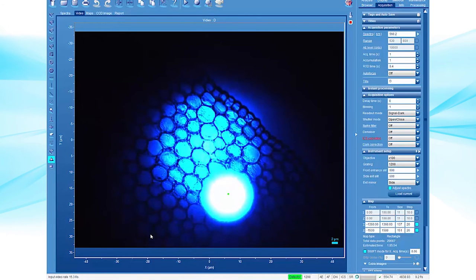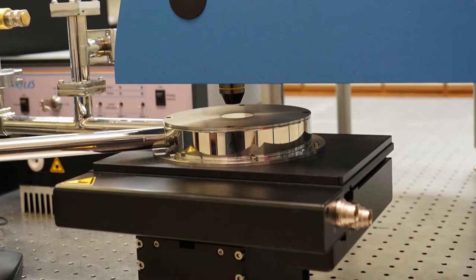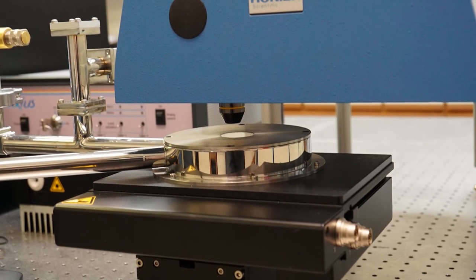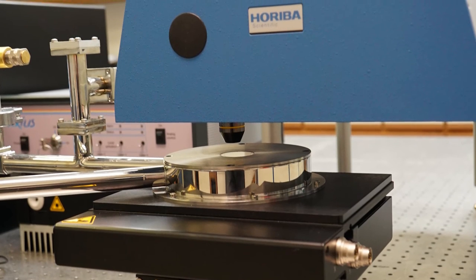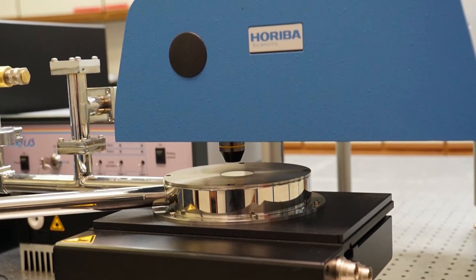Direct coupling of the microscope head provides the highest possible throughput, while the versatile custom platform may be adapted to handle a large variety of samples.